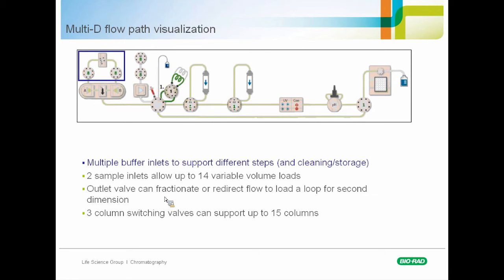We then have the elution gradients from the protein A column as seen here by the %B profile and as seen here by the drop in the pH. But we don't see the elution peak from the protein A column. And the reason that we don't see this is that this wasn't directed through the detector. This was sent to the P6 column, which was plumbed in line.